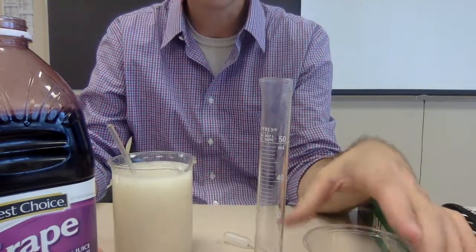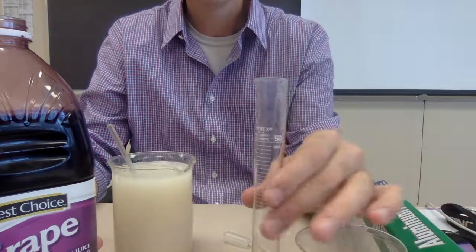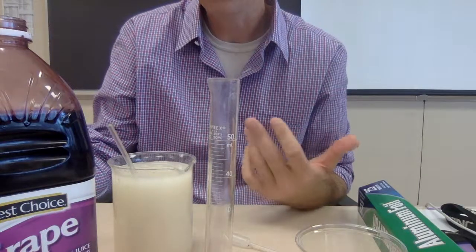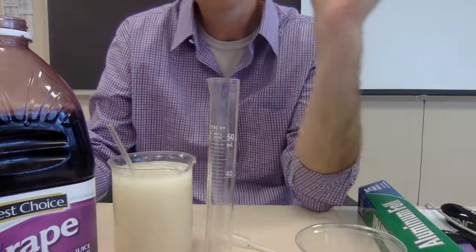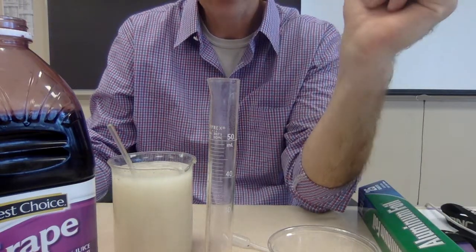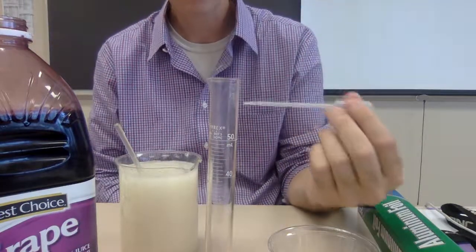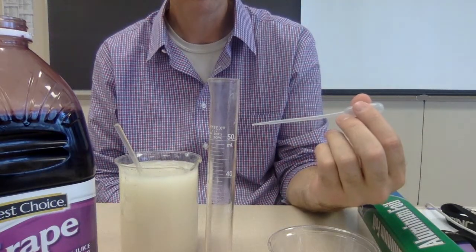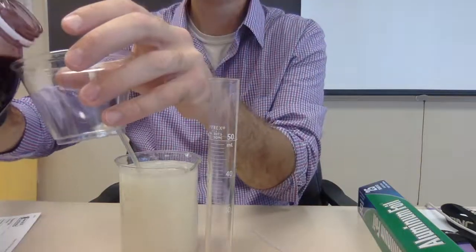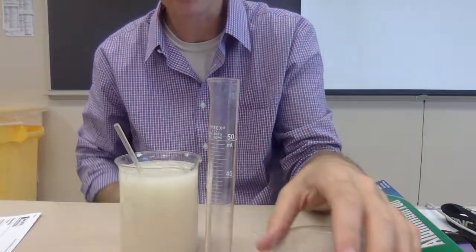Okay, the plastic cups will be on one of the lab stations. Okay, you'll pour that in there. I'm not going to measure it right now because I don't want to spill grape juice all over my desk. So you'll put 19 milliliters in the cup. Then it says to take 25 drops of the yeast solution. Okay, 25 drops equals 1 milliliter. So, we have our grape juice. I didn't measure that, but you get the idea.